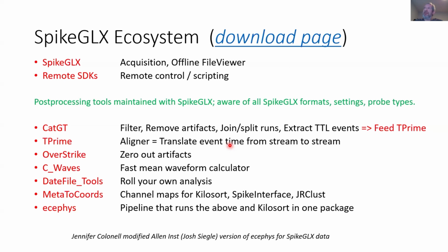So SpikeGLX is more than just a single program. It's part of an ecosystem. There's a bunch of other programs that I also work on that go together with this. In particular, we have a bunch of scripting languages. OpenEphys can be expanded by plugins, and we offer you a scripting language where you can write your own extensions to SpikeGLX using your favorite language. And I'll talk more about that a little bit later.